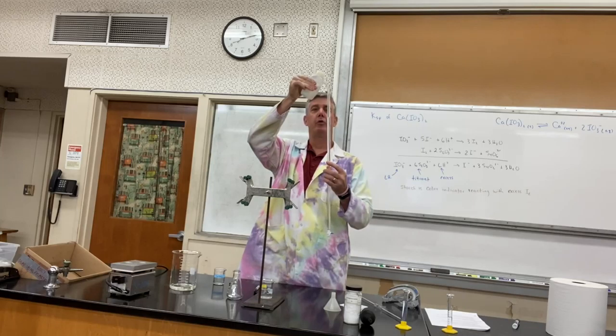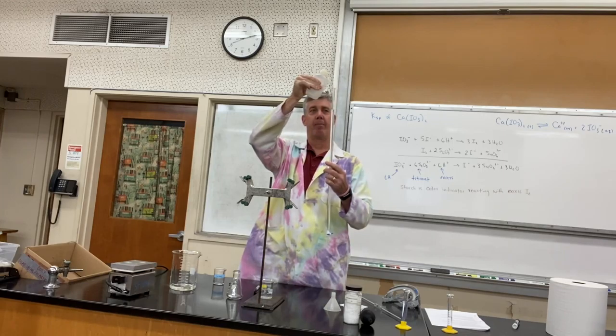So now we're not going to dilute our thiosulfate at all or change the concentration. Now we can fill up our burette.